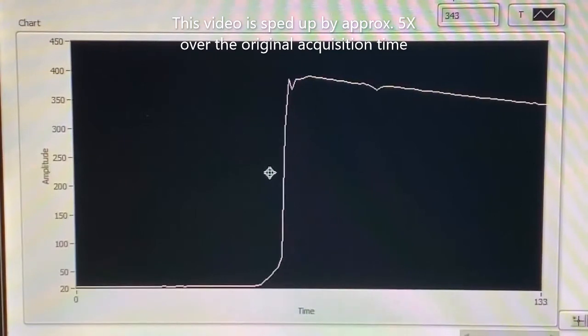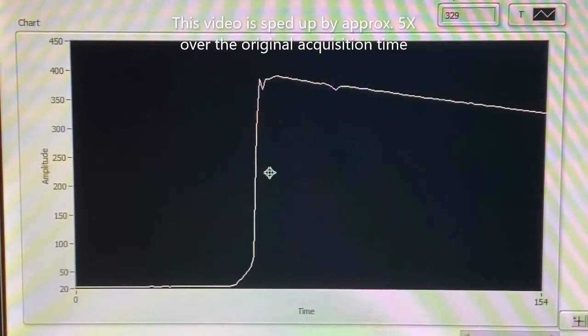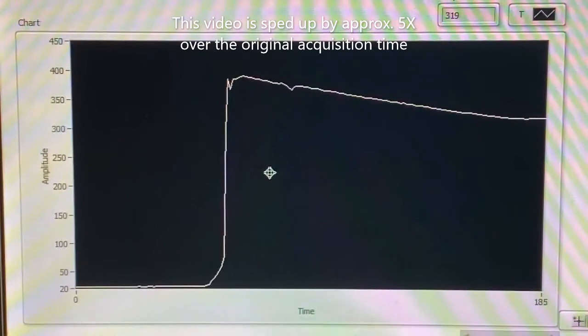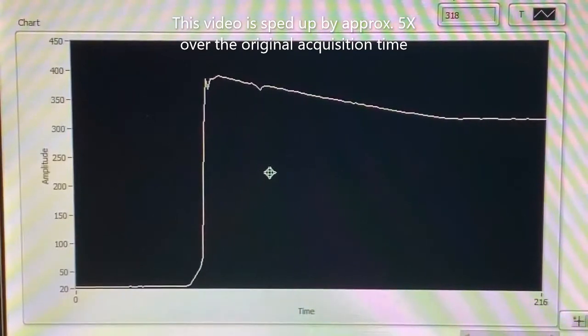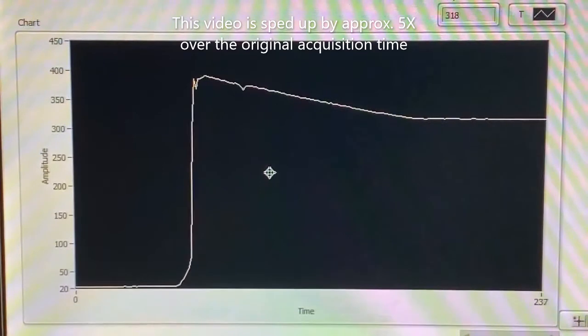You will note in the video that as the lead cools, it eventually reaches the melting temperature of lead. The cooling curve stops going down and reaches a plateau or an isotherm. This isotherm is at the melting temperature of pure lead, where the liquid is being converted into solid.